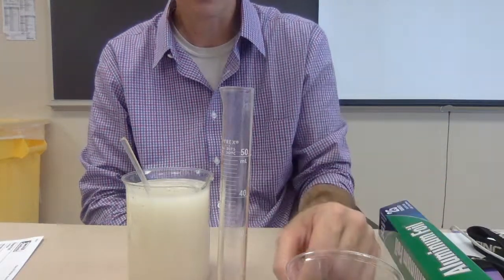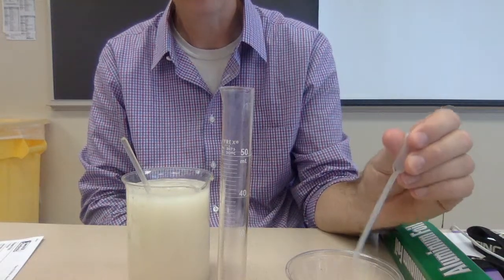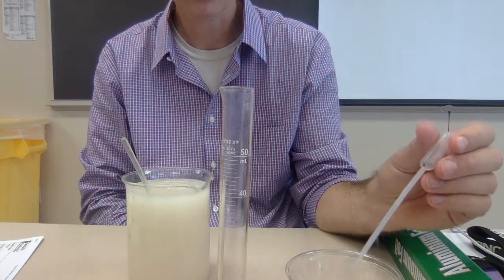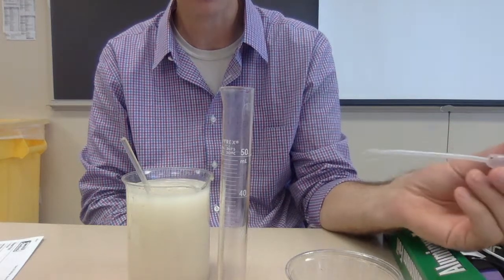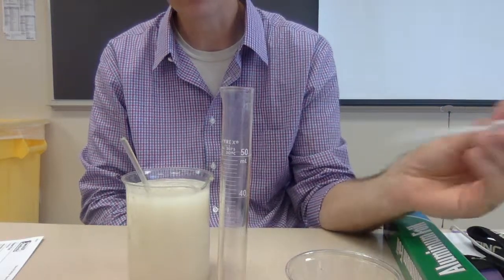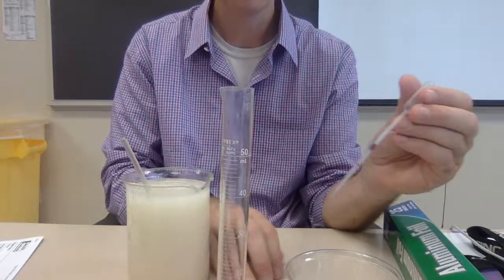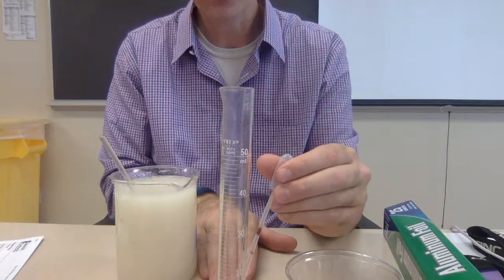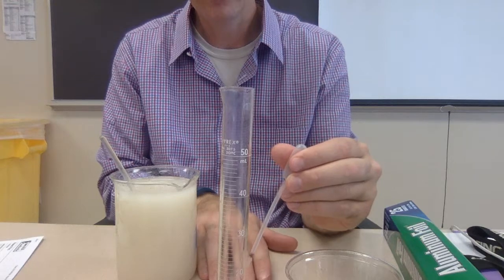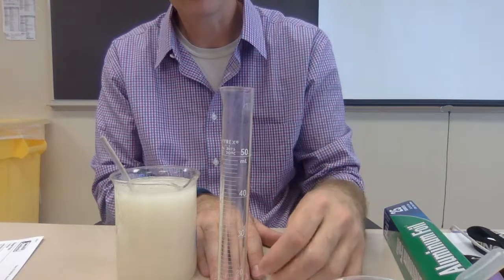Okay, we're then going to put 1 drop of the yeast grape juice solution. Okay, if you're using the same eyedropper, you want to rinse it out with water really, really well. Otherwise, you'll have a bunch of yeast in there, and there's going to be too many to count. So make sure you use water and suck up water and all that stuff in the sink. Okay, you'll take 1 drop of your solution. You'll put it on your slide like this, and then you'll take your cover slip and you'll put that over the top.